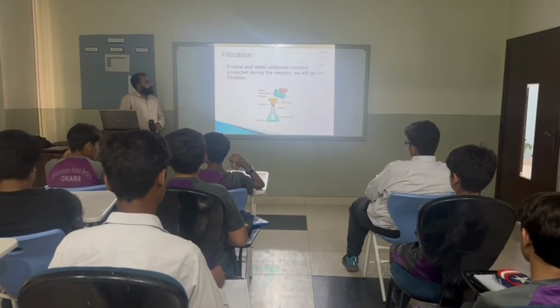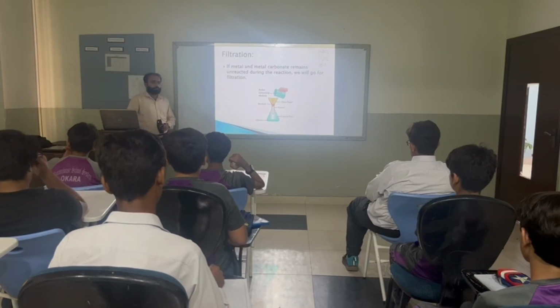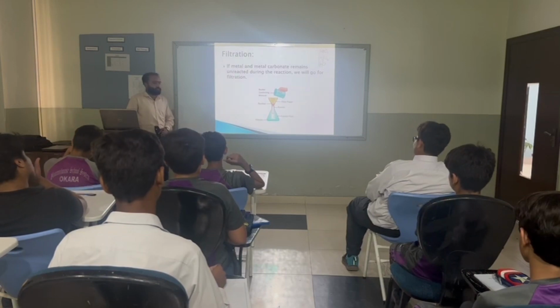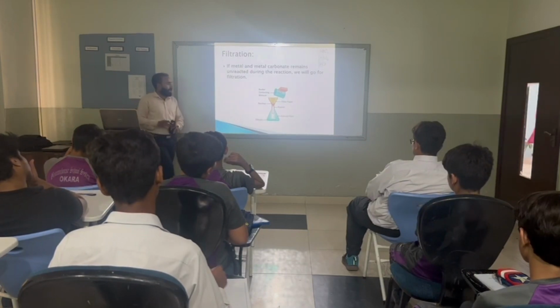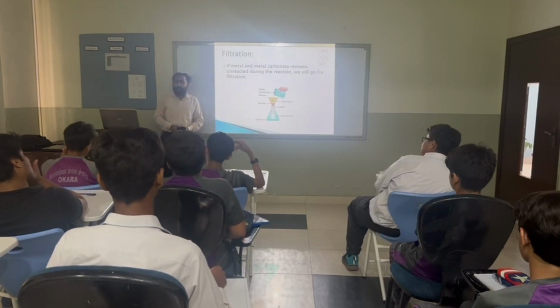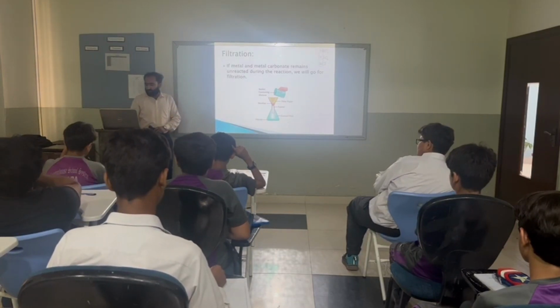After filtering the solution, we will separate the unreacted metal and unreacted calcium carbonate from the solution, and then we will have a clear solution or clear filtrate without any unreacted metal or calcium carbonate.